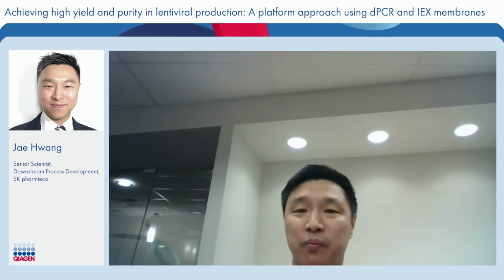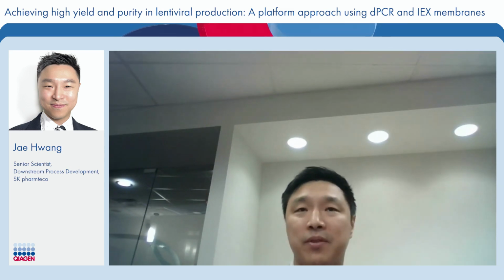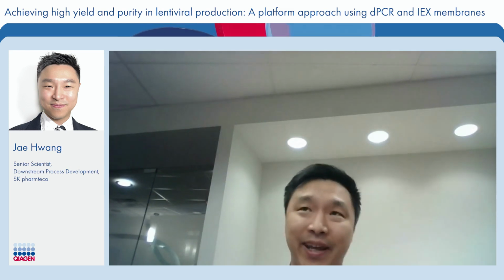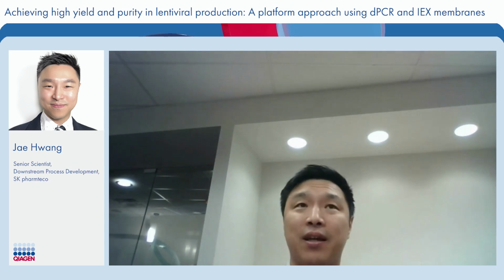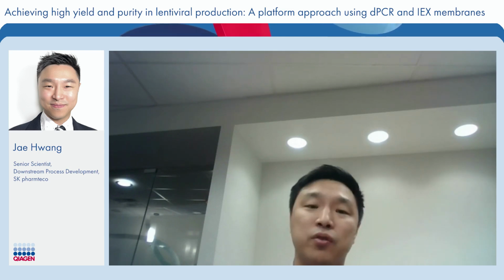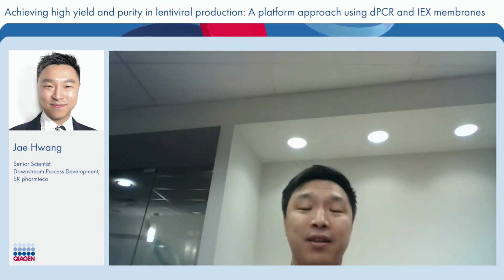So that will be some benefit for our process and also for GMP teams where they need longer processing time to prepare everything. They can actually put the IEX capture eluate at 2 to 8 degrees C overnight and then process the remaining downstream the next day.